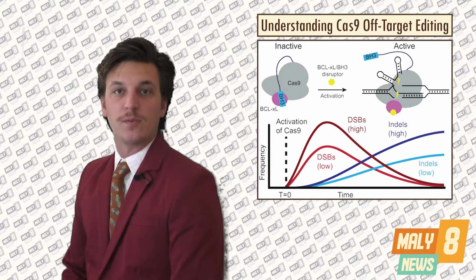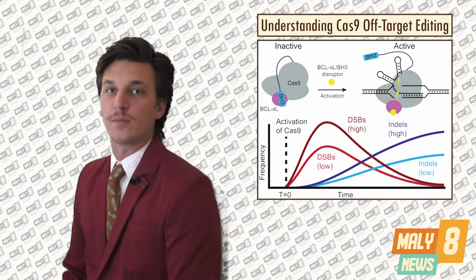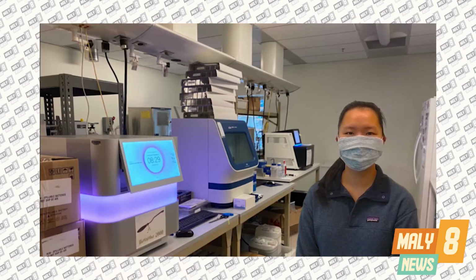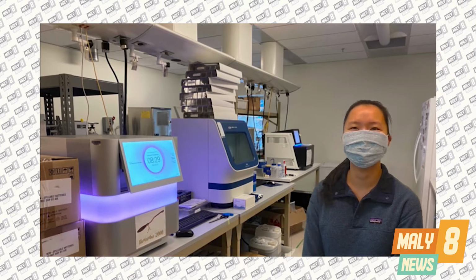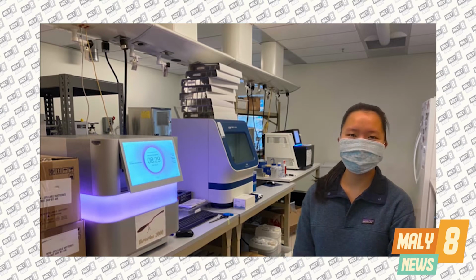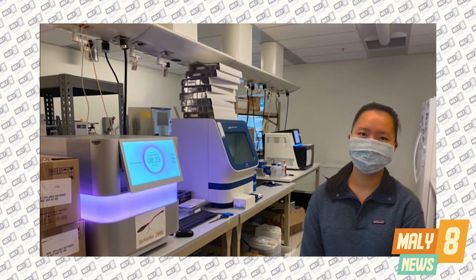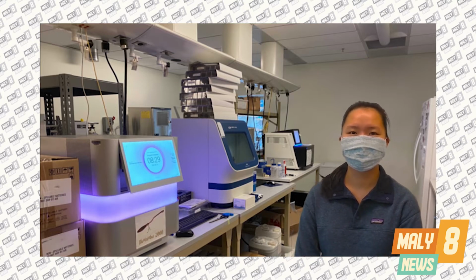In our first segment, we'll be joined by Cindy, who will tell us more about experiments she's using to study CRISPR-Cas9. Hi, Cindy. How's it going? Good. Tell us what you're up to. I'm just prepping some samples to load onto the sequencers for my experiment. Look at all those sequencers. What information will they give you?